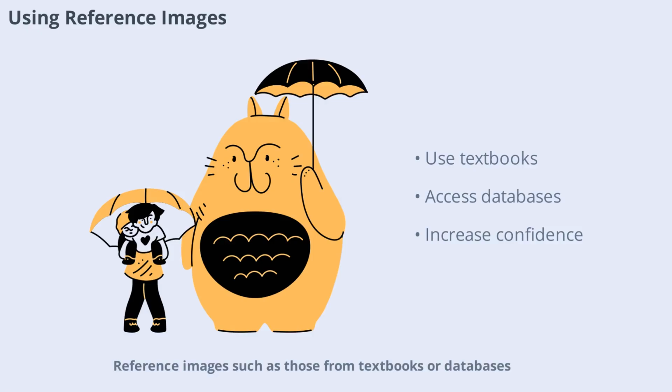Reference images, such as those from textbooks or databases, can help you identify features in your own samples. Comparing your images to well-documented references increases your confidence in your analysis and helps you avoid misinterpretation.